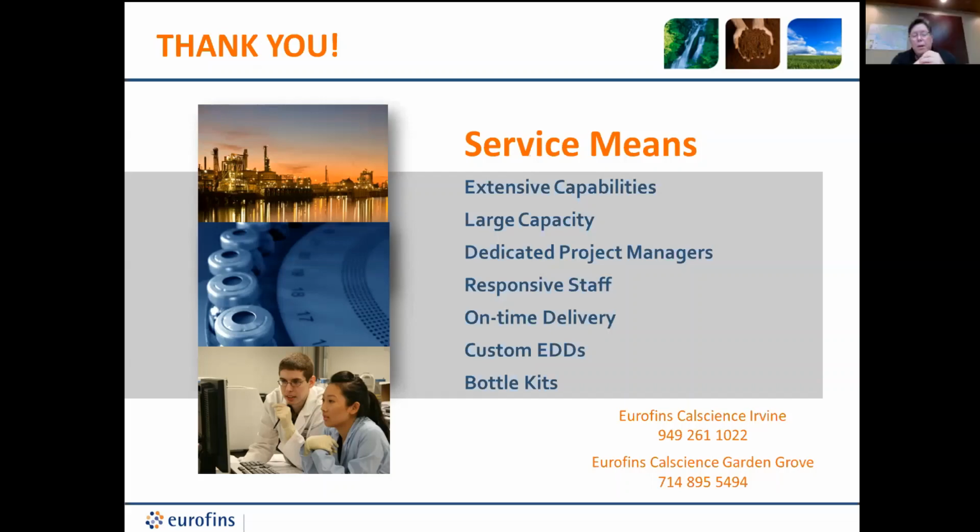We would probably not composite your sample for oil and grease. If you're collecting in an ISCO or doing something like that for non-stormwater type stuff, it could composite for you, but for oil and grease, we would probably not composite them. We would probably run them as discrete aliquots unless you asked us to. And at that point, we would have to pour them into a very large container, all of the sample, rinse out each container with aliquots of hexane, and keep processing it that way.